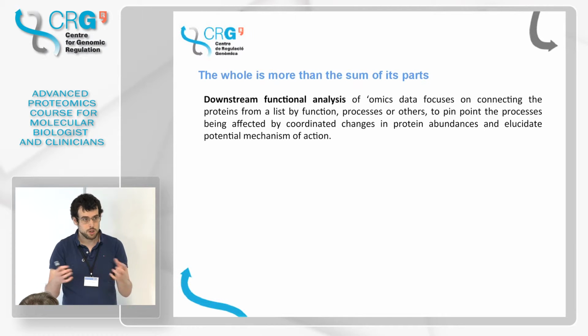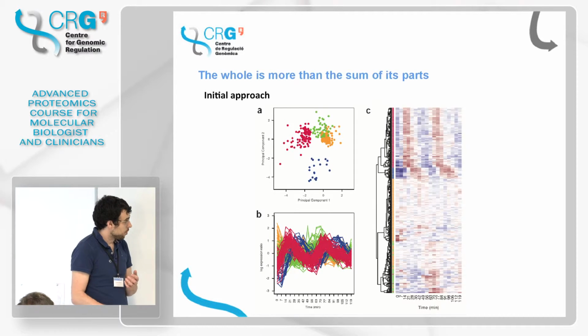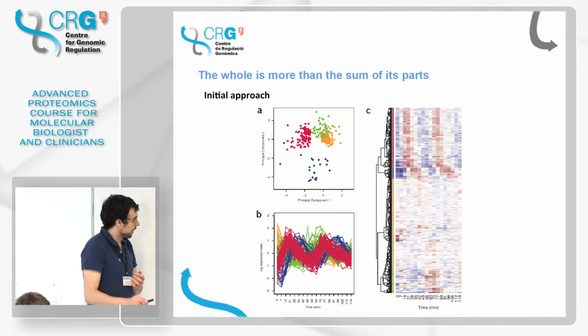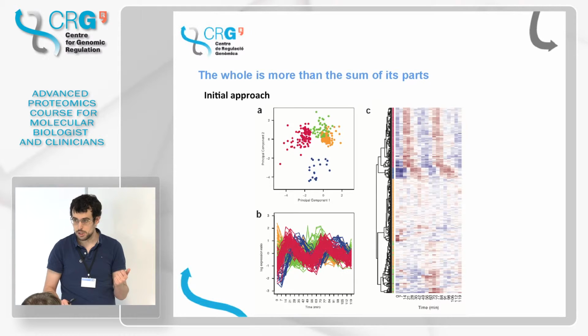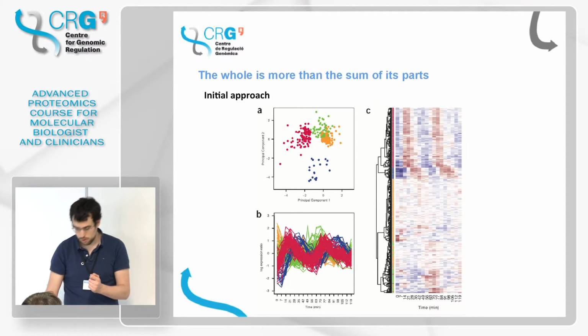And we will see now some, or we have already seen in the previous session, some approaches, for example, for class discovery. For example, profile plot, heat map plot, and hierarchical clustering, PCA analysis, and also k-means analysis, right? And we saw this in the previous session. We will practice this afternoon.